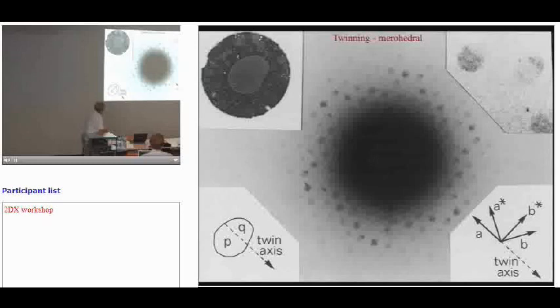So what's happening here? This crystal is 2 crystals. And this crystal is like this, P3, and this one is upside down. And because all the molecules are in rows, they line up and you get a perfect twin boundary. It's exactly the same as in 3D crystals. And if you just put all the data in together, you get the wrong amplitudes and the wrong phases and so on. So you have to be aware that might happen.